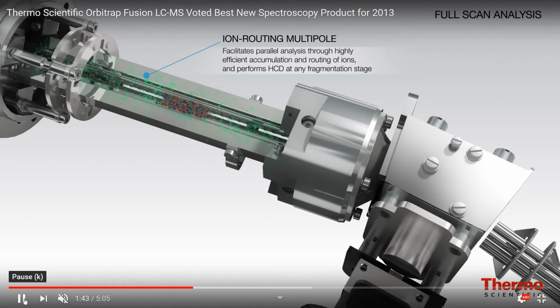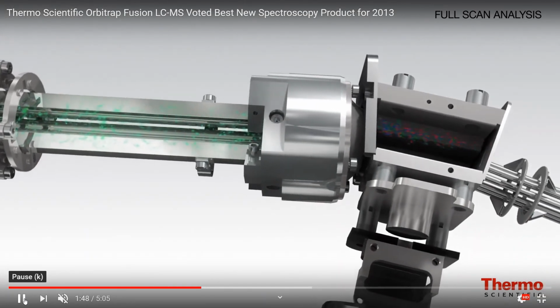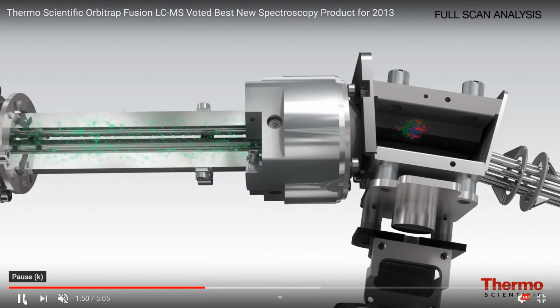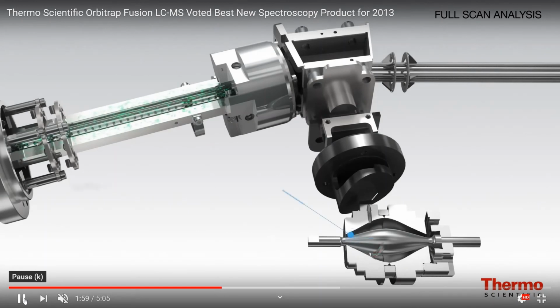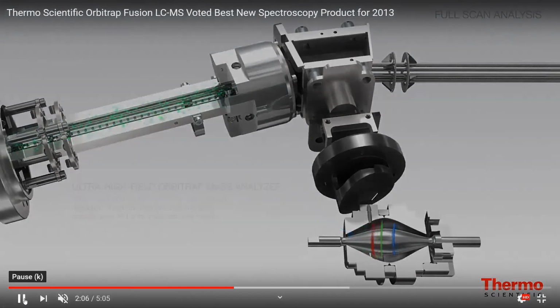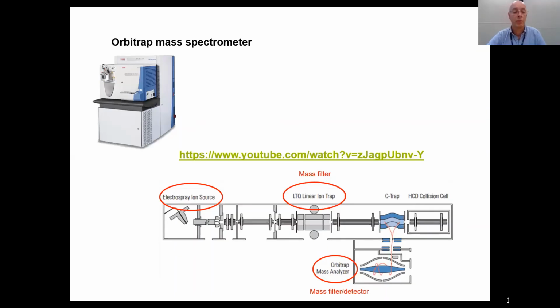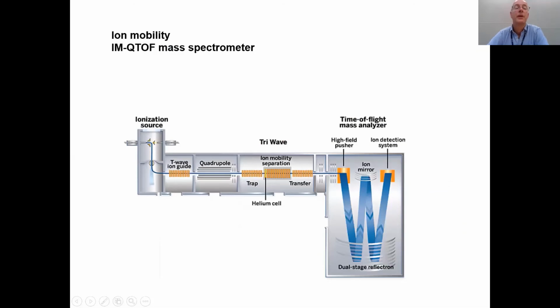We can accumulate ions and then pass them into the C-trap. When they pass into the C-trap, they are then focused into a small packet, and then that packet passes into the Orbitrap. The ions are cycled in the Orbitrap and they will generate a signal. Okay, so that's an Orbitrap.